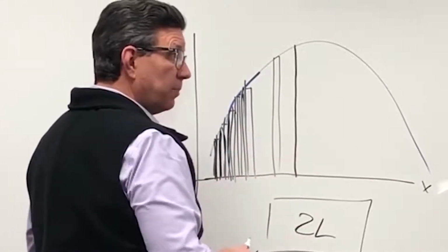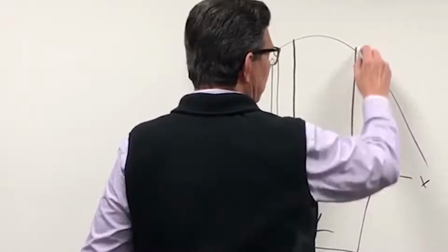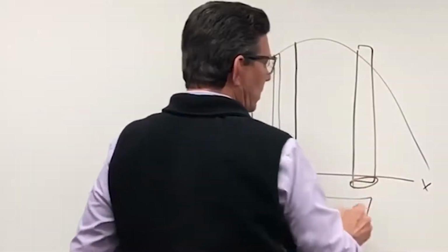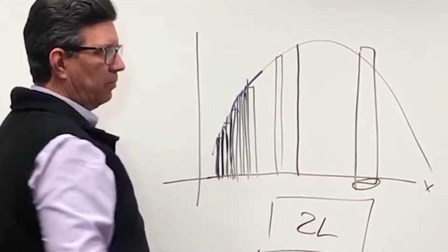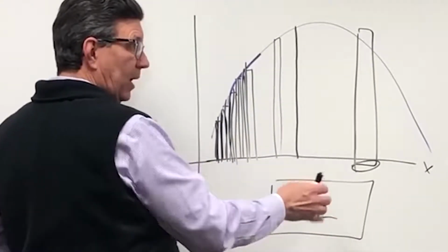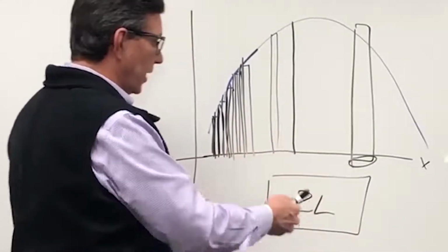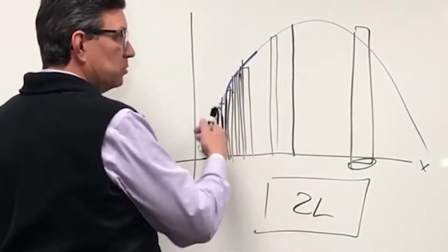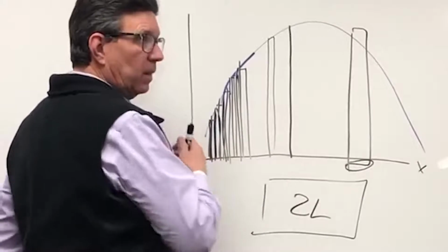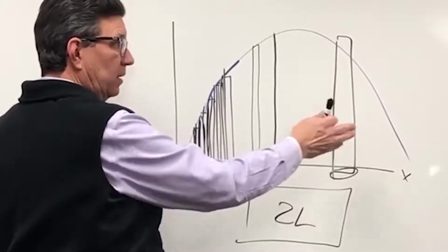It's extremely representative, and it's much more representative than if I just come in here and take a snap sample at some point in time along my process. And so that's why this 2-liter bag full of fluid, milk, liquid egg, juice, whatever it happens to be, looks much more representative of what's happening in your process.